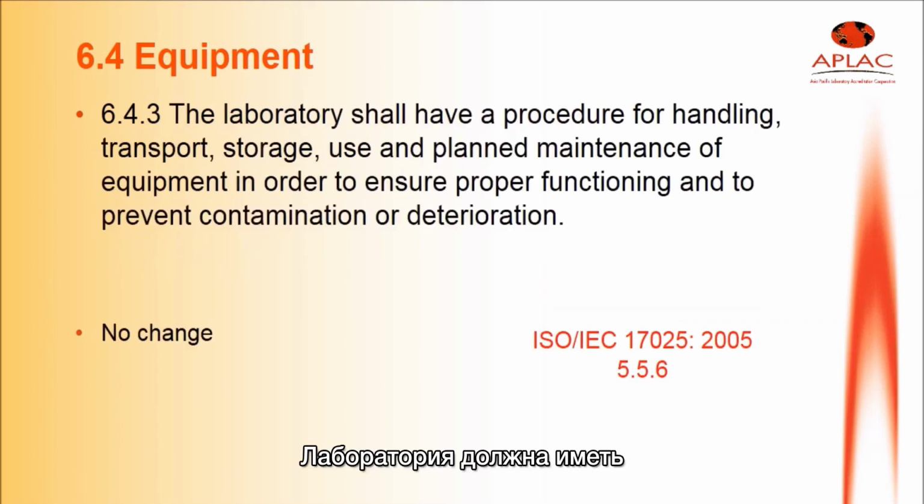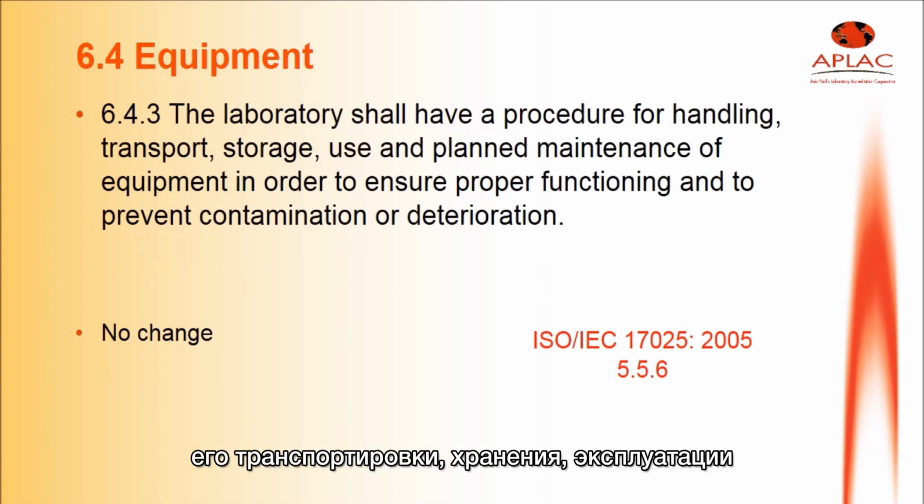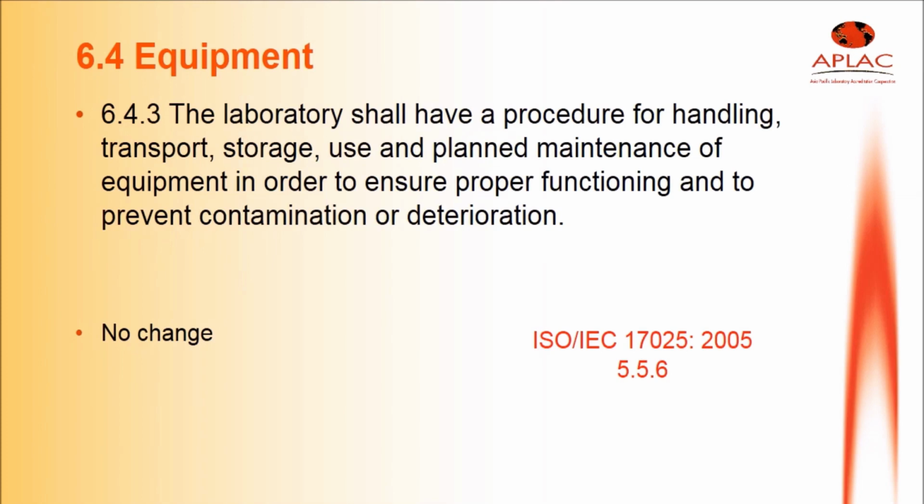The laboratory shall have a procedure for handling, transport, storage, use, and planned maintenance of the equipment in order to ensure proper functioning and to prevent contamination or deterioration. Compared with the old version of 17025, this clause is the same, there's no change.